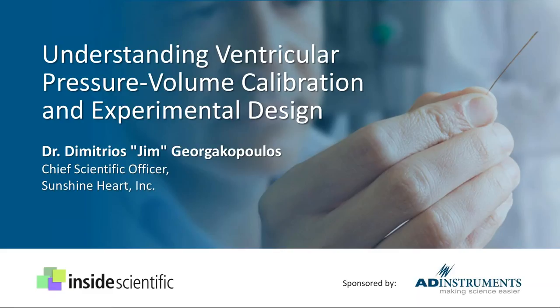We are joined by Dr. Jim Georgakopoulos, Chief Scientific Officer at Sunshine Heart Incorporated. Jim started his PV loop research in 1994 alongside David Cass. Over the next 10 years, together they worked on many firsts pertaining to PV loop science, including development of the first systems and methodologies for obtaining PV loops in the mouse, and were the first to publish a paper showing PV loops collected in an animal model of this small size. They went on to study force-frequency relations in the mouse, assessing calcium dynamics in vivo, and also study the role of nitric oxide in neural control of the circulation through the baroreflex.